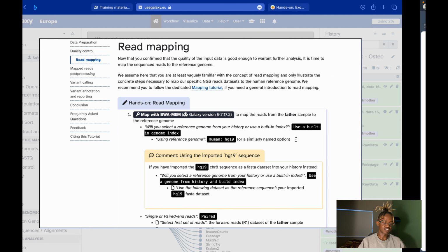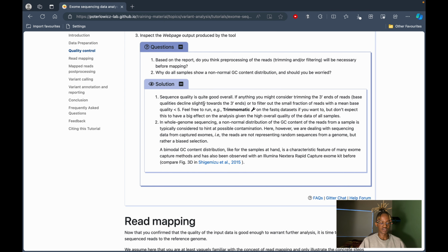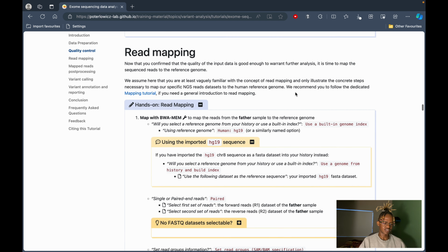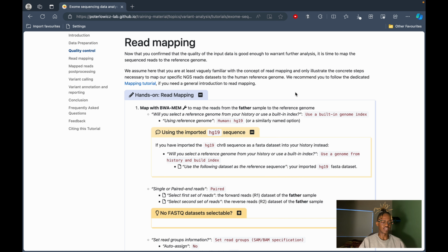Okay, for some reason the Trimmomatic tool is not working for me today, so we're skipping that step, I guess. As stated, it's not really a necessary step, it's just nice to improve the data.